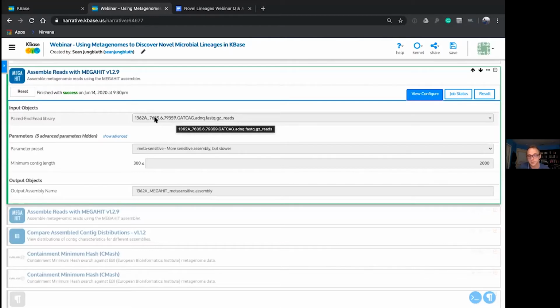Specifically with the sample from location A, we lost about 33% of the reads during the pairing, and we lost about 50% of the reads for sample B. And so we include all of that information here for the assembler to use.